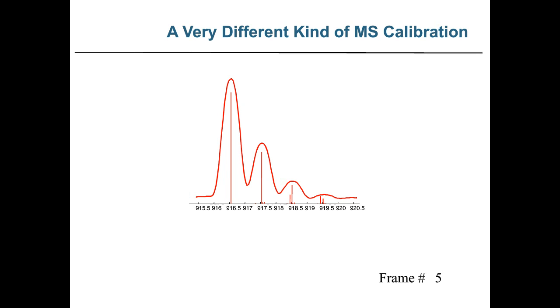So now what we do is we compare our measured standard from the mass spectrometer, with its undefined line shape, to that of the ideal or the true calculated spectrum. And from the comparison of these two, using the magic of a little bit of linear algebra, we can actually calculate a function which explains the difference, and that's that green squiggle that I just drew up there. That function explains the difference between those two curves, the perfect true mass spectrum and the uncalibrated raw mass spectrum.